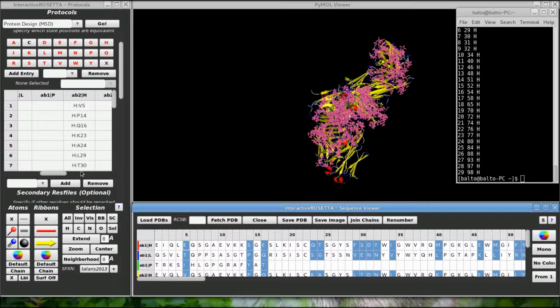The first valid residue was the first selected residue on heavy chain 2, so we got all the right residues in this column as well. And last but not least, here is the third column. See how easy that was?